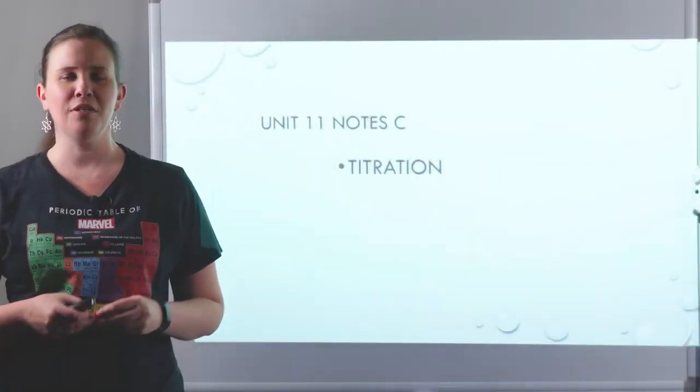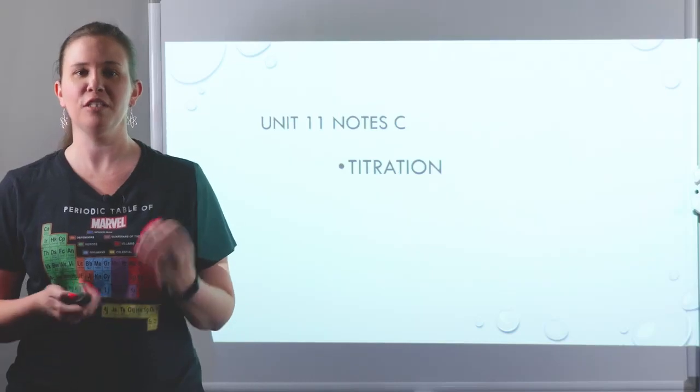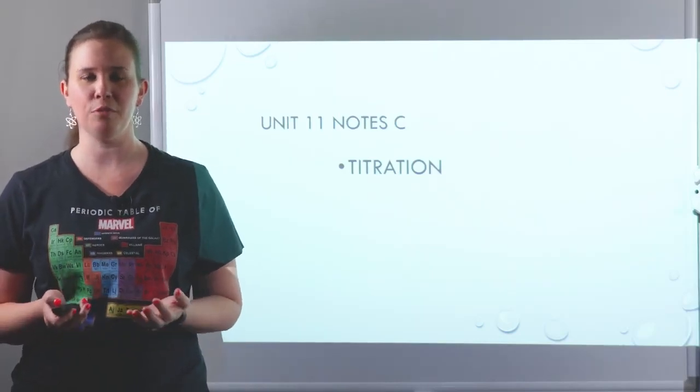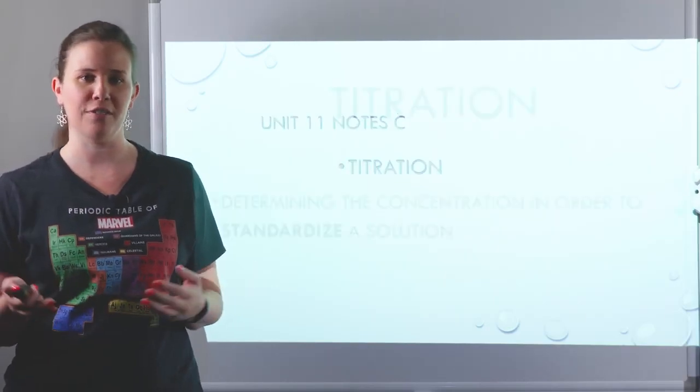Hey guys, welcome to Unit 11, Note C. Today we're going to look at titration, a special kind of experiment that's going to help us determine the concentration of either an acid or a base using a neutralization process.